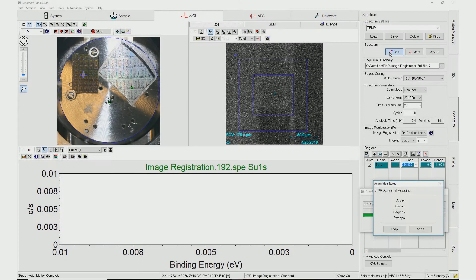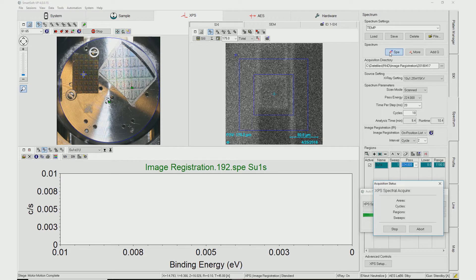After the Image Registration setup is performed by drawing a box around the distinct feature and adjusting the search area to the desired size, the XPS acquisition parameters are created and analysis can begin.